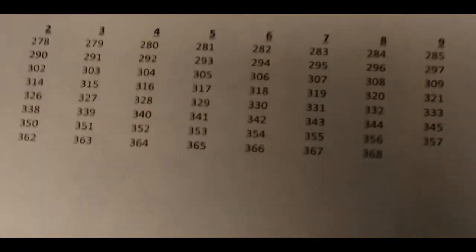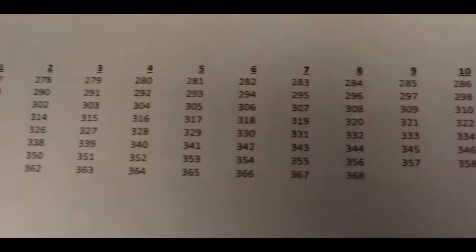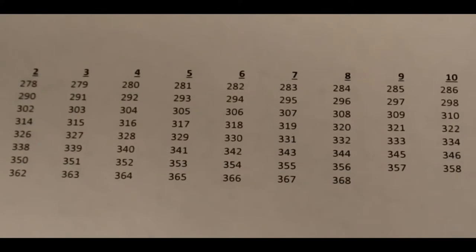And our plate here is also going to be numbered as a book, of course. They have a different capacity, and we will be given a key where you can see here that our first well is 277 and we end with 368.